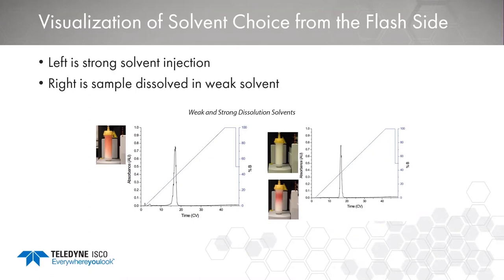To visualize weak versus strong solvent loading, we use flash columns where we can see through. On the left, a compound dissolved in a strong solvent has already traveled down to the bottom of the column just after loading — you see band broadening and poor retention. On the right, a sample dissolved in a weak solvent shows no color traveling down the column after loading until the percent B reaches a point where it begins to travel. This is a really good visual example of how compounds behave on the column when loaded in a weak versus strong solvent.